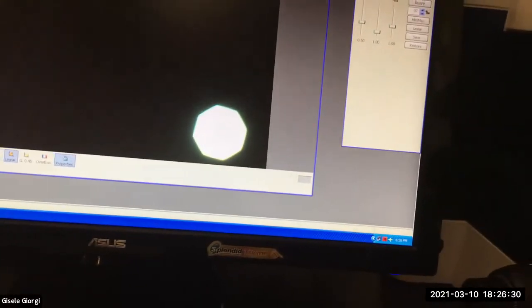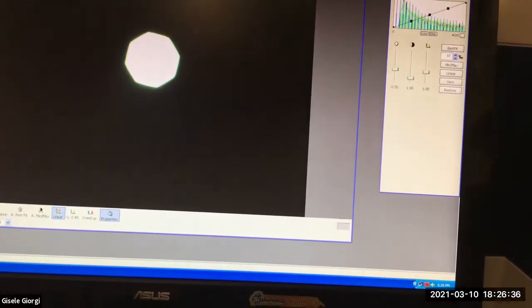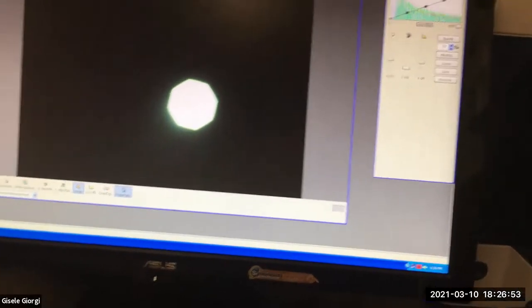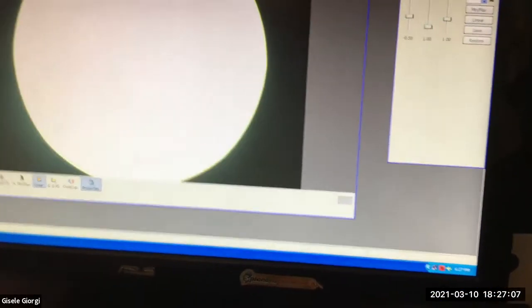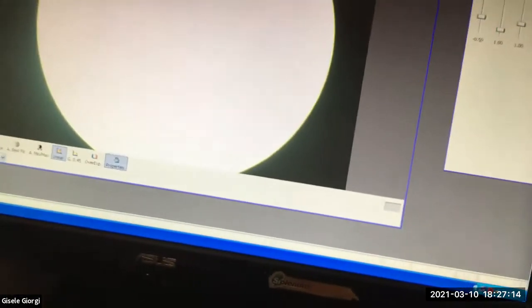But basically, this is a situation of whatever works. You're just working patiently, diligently sometimes. This scope is very responsive, probably part of the big price tag. Some scopes, the centering screws are kind of jammed, and they'll only move in certain directions and you have to go in circles to get it to center. This scope, watch it start being silly in just a minute, because I'm saying it's pretty easy to center. But whether you work with it stopped down, the field stop down, or open, whatever works. And I'm a little perplexed that it's not opening beyond.